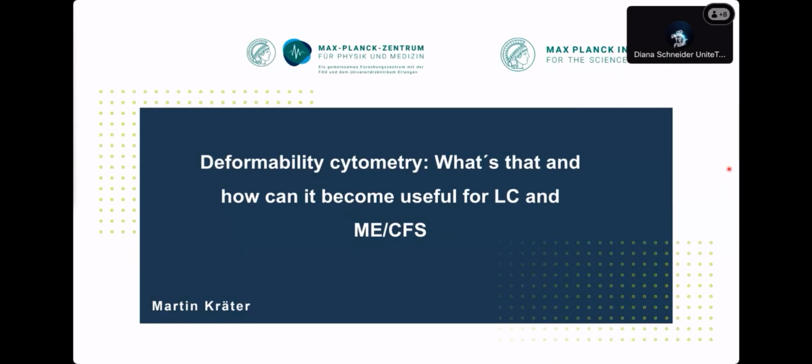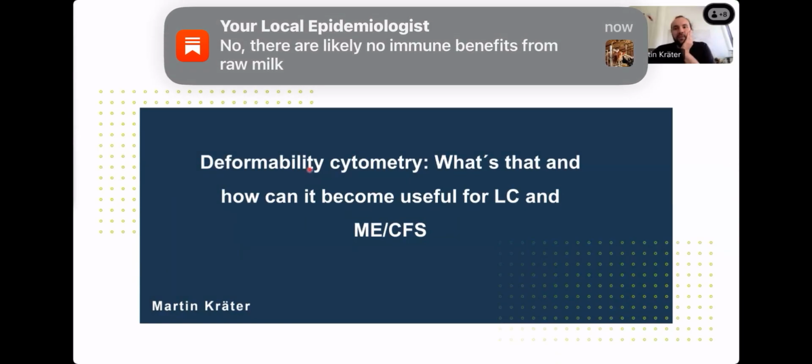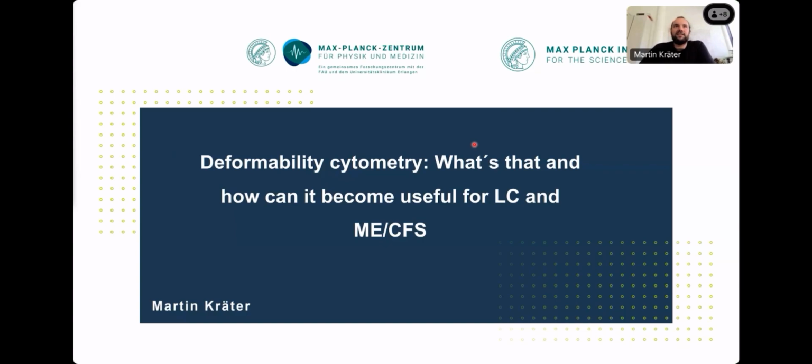Thanks for the invitation. As you said, I'm going to talk about my favorite piece of technology, deformability cytometry. And I rephrased it a bit. So what is it and how can it become useful in the context?